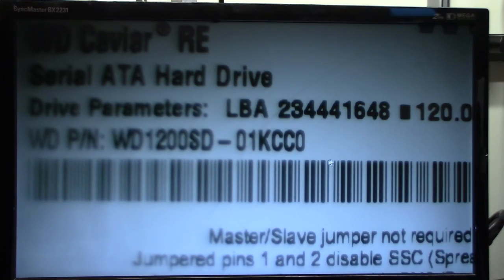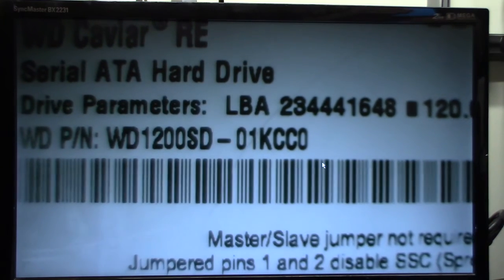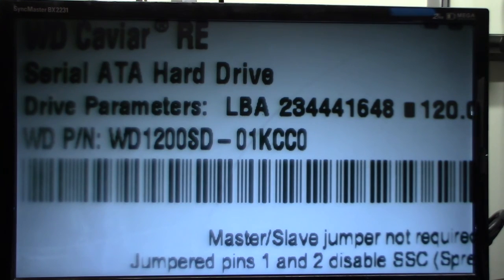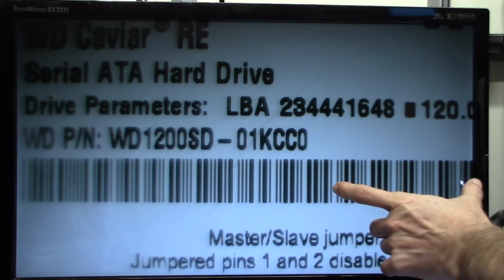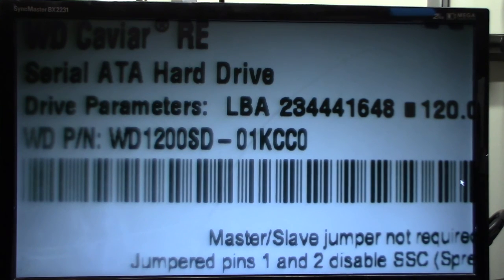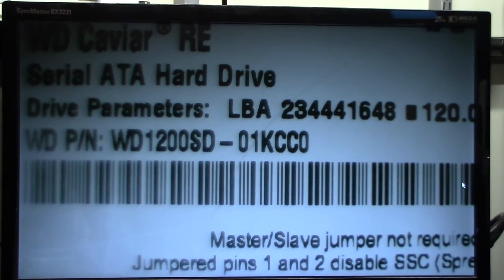It was a waste of money for the 037 lens. Most people are going to bring the center of the image in focus by turning the ring until they get the center focused — which in this case is going to be about right here. Now you have this center bar in focus, but the zero is now out of focus on the right, and the bars are out of focus on the right. About 35% is out of focus here, and 35% out of focus here, with just a little bit in the middle that's now in focus. So the 050 definitely works a lot better — don't waste your money on the 037 lens from TubeTech. It has horrible optics. I'm going to see if we can find something else to possibly suggest before I do the full review on this camera.